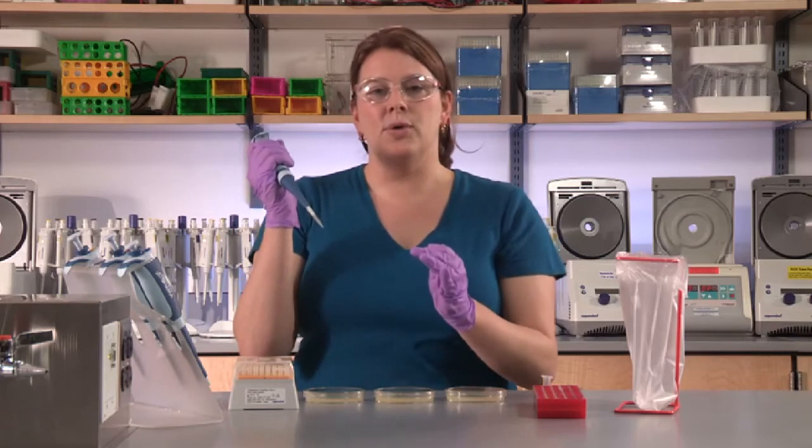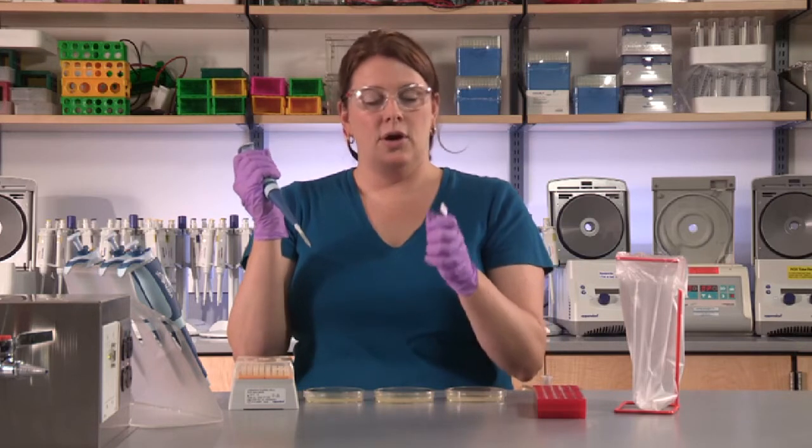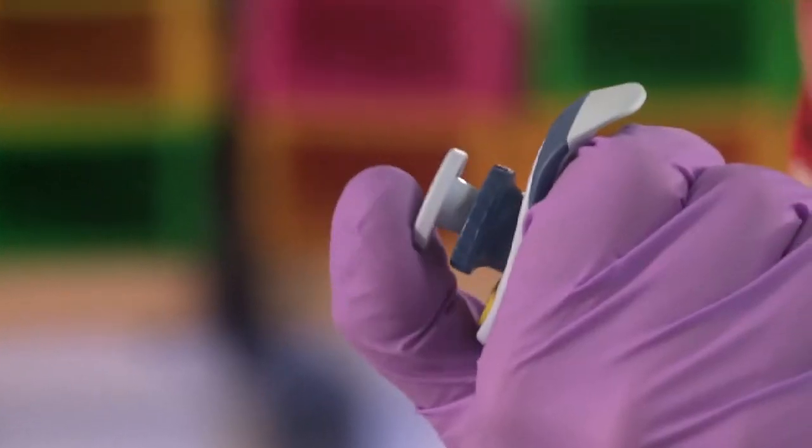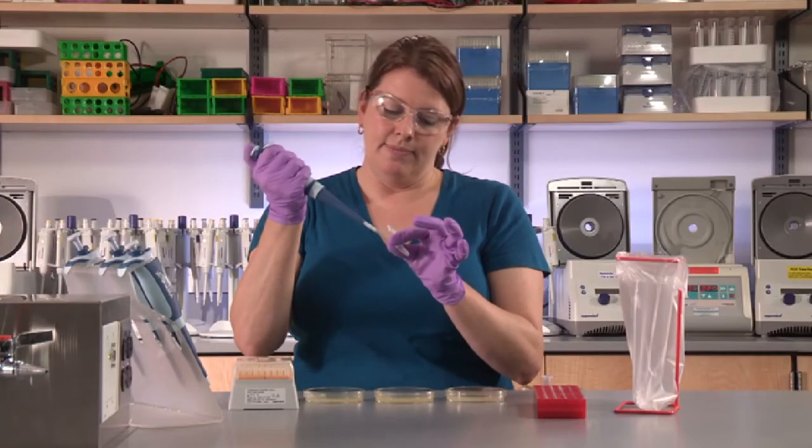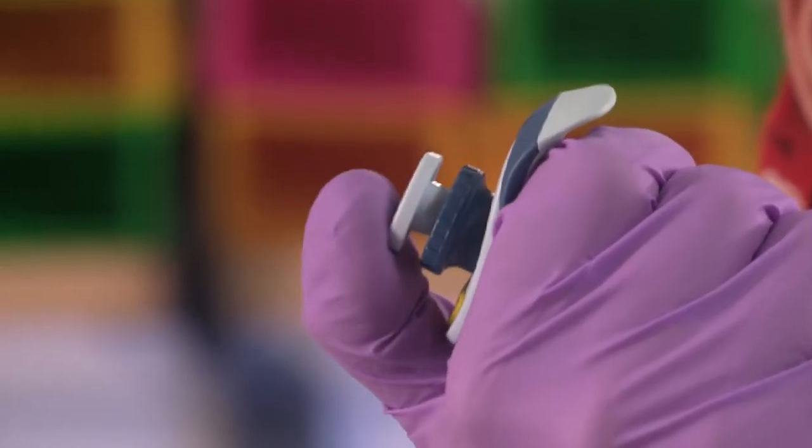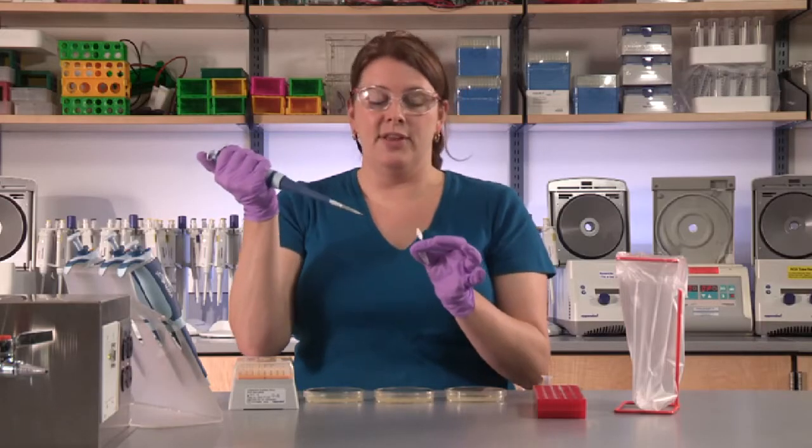At this point, you want to be certain that you're using proper aseptic technique. Open up the tube of P- cells. Press down the plunger on the pipette and gently mix the cells up and down. Draw up 50 microliters.